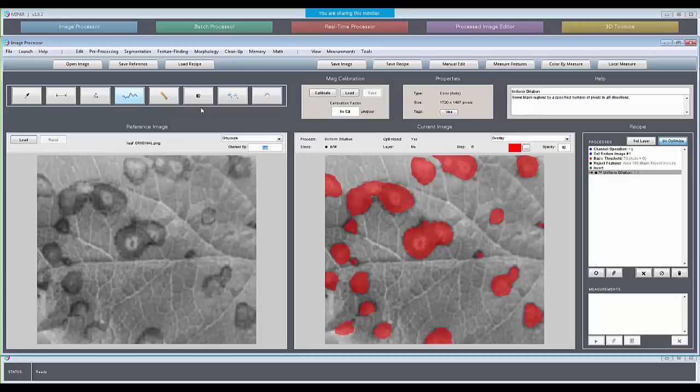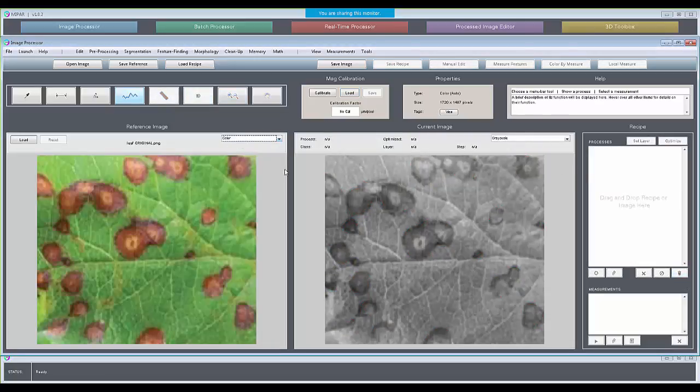So your color image has 3 channels, red, green, and blue. The auto mode is what's used initially. Let me clear this recipe out so we can just see the building of this. So initially you have this auto grayscale conversion of the color image over here. That's the starting point for your recipe. We can have, though, the first step of the recipe be to use a different channel operation.